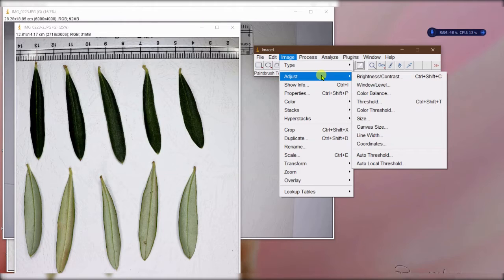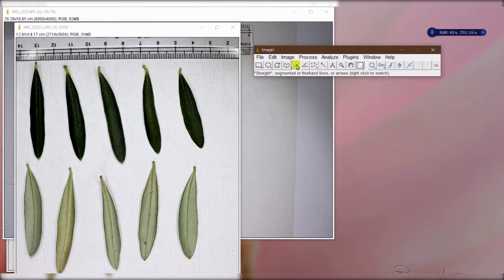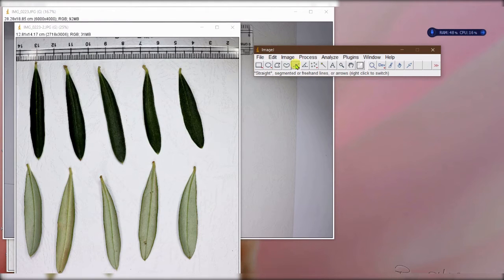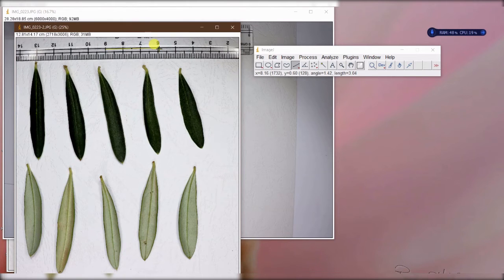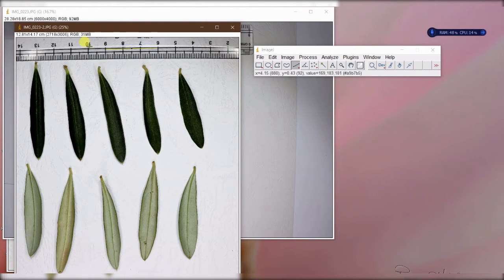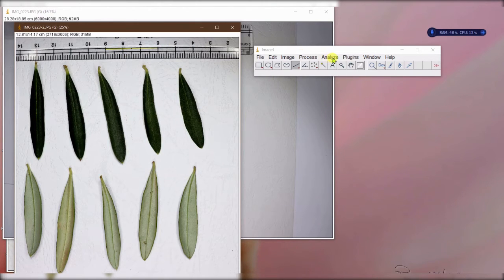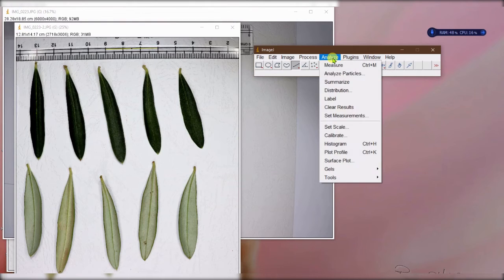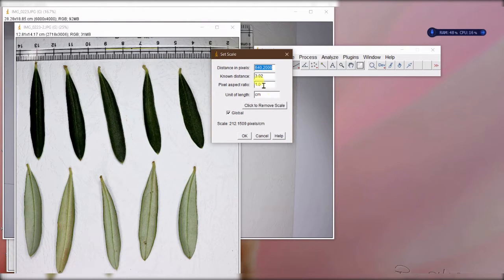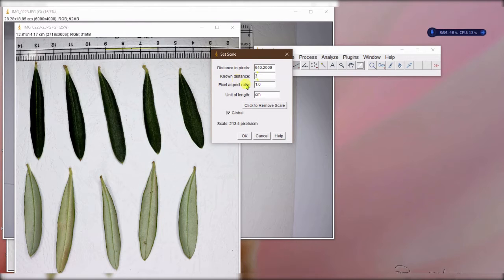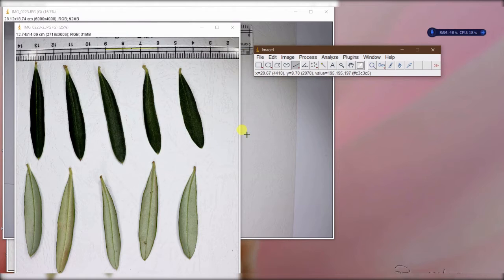Next is to set the scale. To set the scale, first thing you need to do is click on this line here, the straight line, and measure the scale. For example, this is going to be three centimeters - I know on the ruler these are three centimeters: one, two, and three. Then I need to go to analyze and set scale. The distance is three centimeters. That is done.